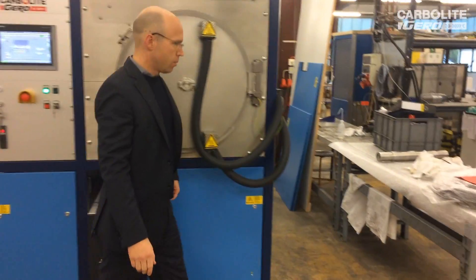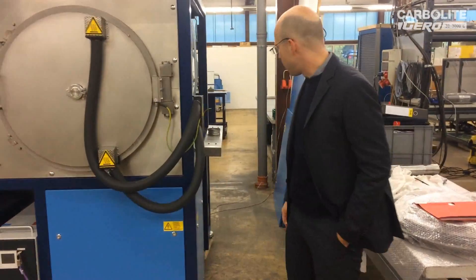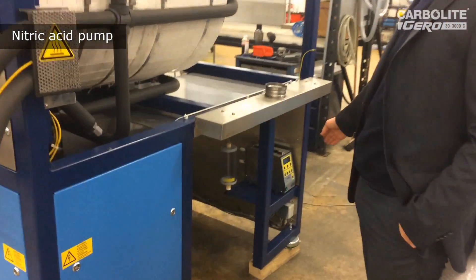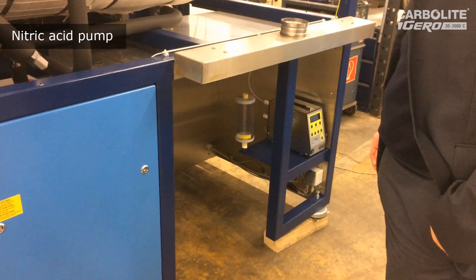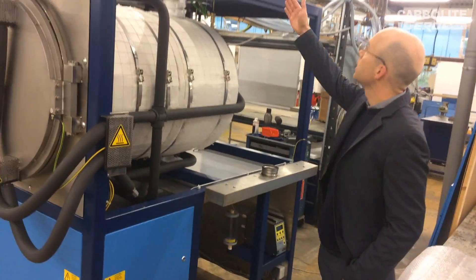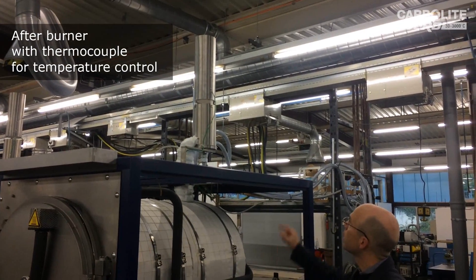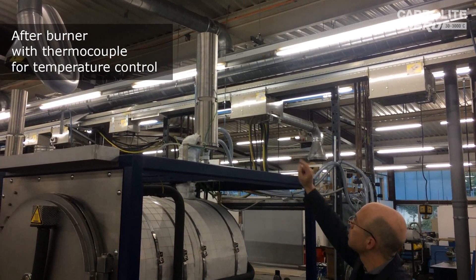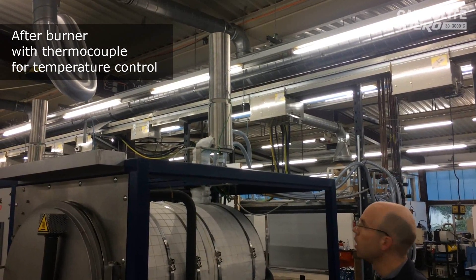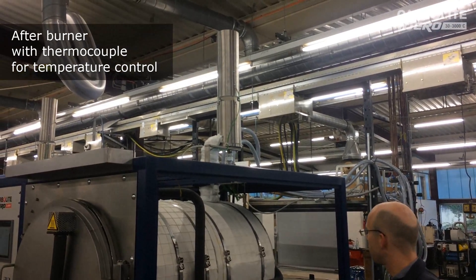Let's have a look around — we will see the nitric acid pump, which is located here, so the customer connects the nitric acid and then can start using the furnace. What we see here is the afterburner; it is located on top of the furnace. We also see the thermocouple which monitors the temperature inside the afterburner.